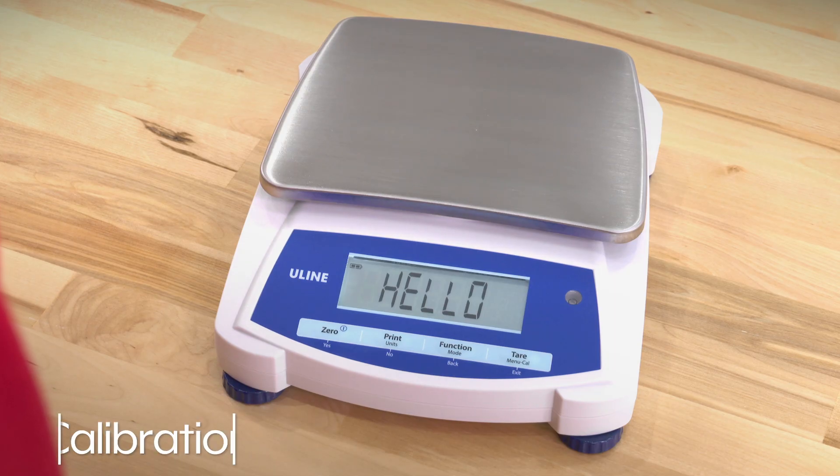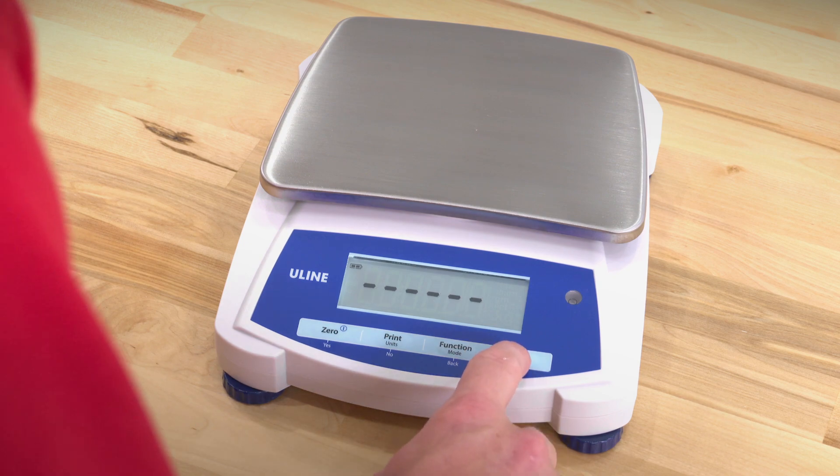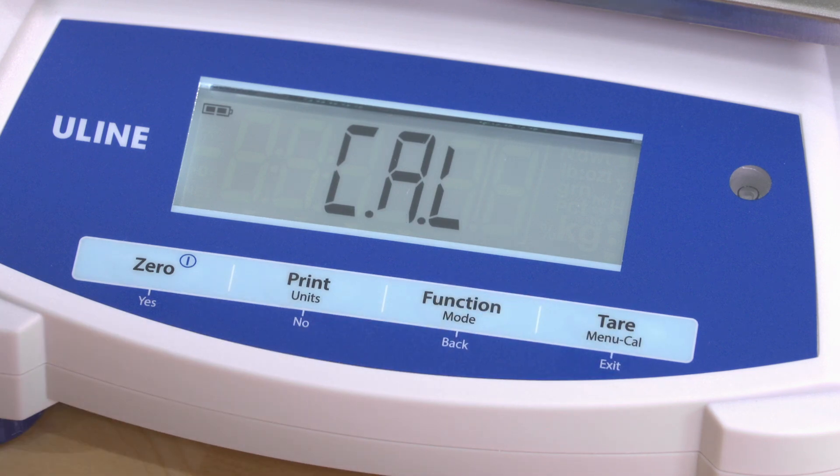If you need to calibrate the scale, press and hold the button Menu Cal until Menu is displayed. When the button is released, the display will show Cal. Press 0 to accept.